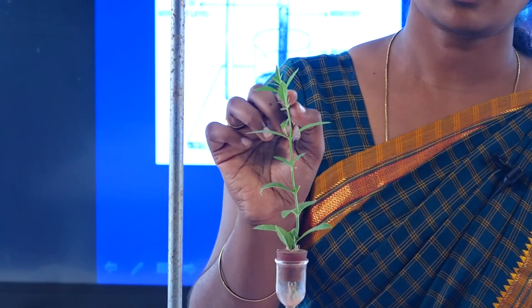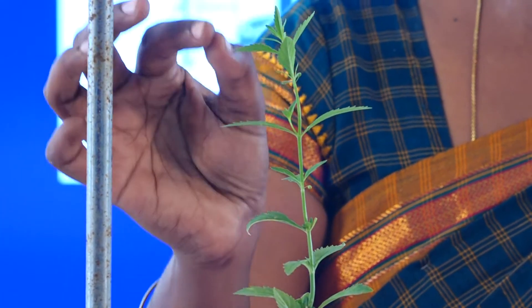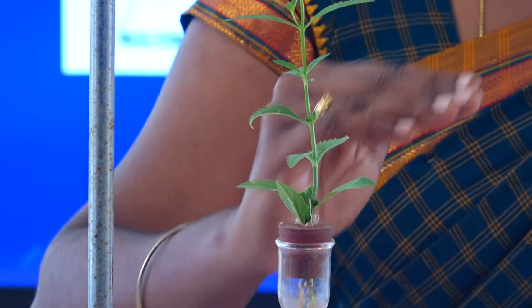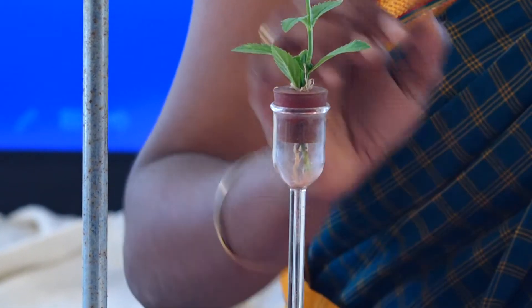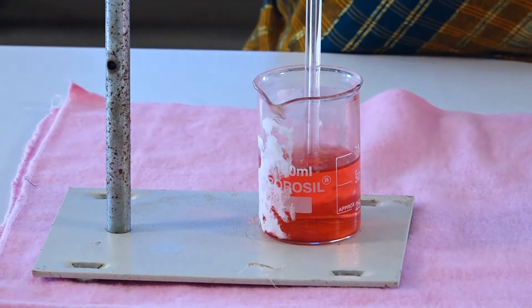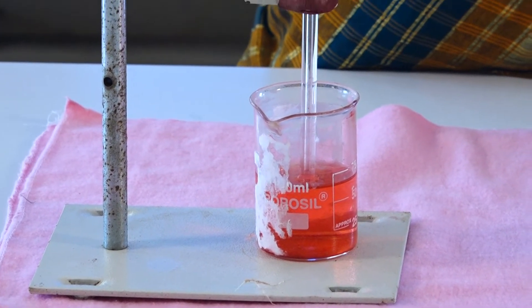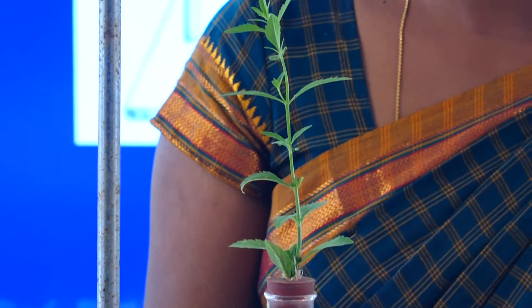Likewise, if there is a loss of water in the leaf, the mesophyll cells present in the leaf draw water from the xylem, and from the lower part of the plant — the root hairs. This is a continuous process. After half an hour, there will be a rise in the water level in the pipette, demonstrating that once there is a loss of water in the aerial part, water rises from the lower part. This is the demonstration of the experiment — transpiration pull.